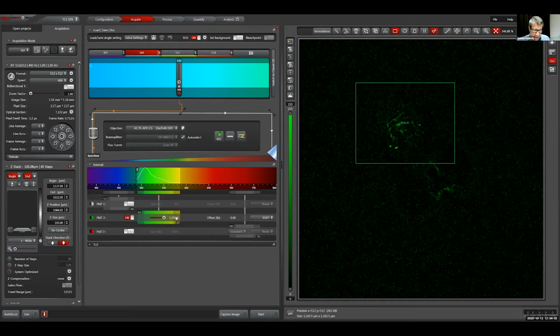I'm going to turn the gain down to 800. Okay, oops, that's 8,000. Okay. And now we're going to do the same 512 by 512 picture and see what happens.